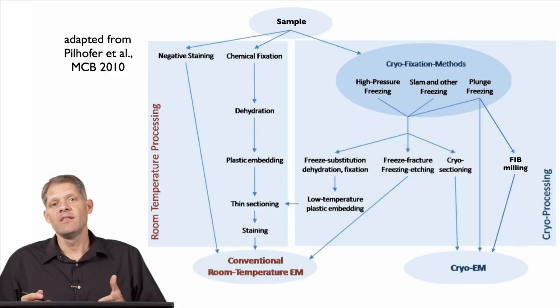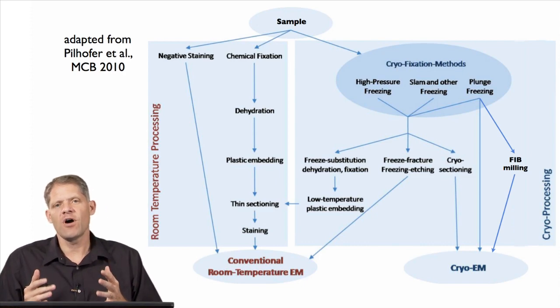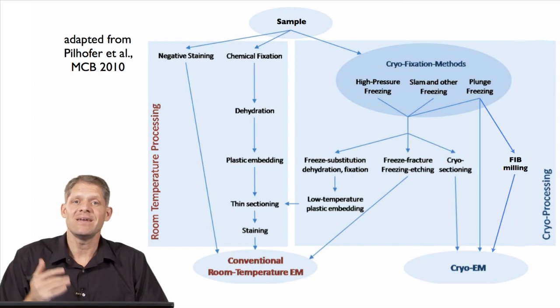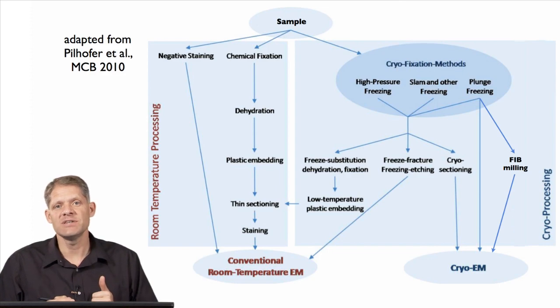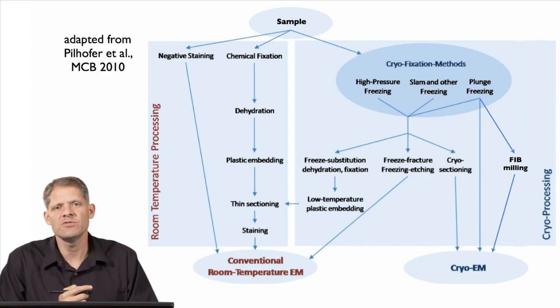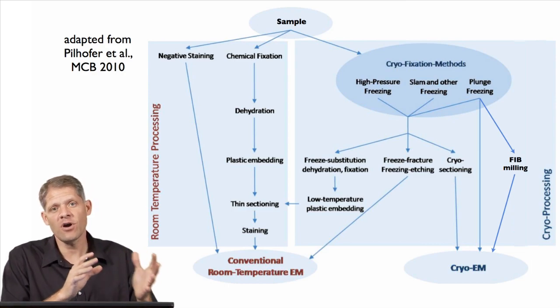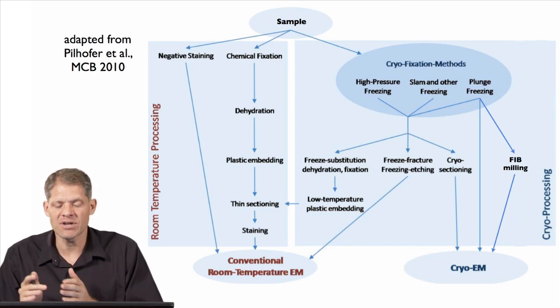So as you can see, there's a myriad of ways that biological material can be prepared for transmission electron microscopy. The key is always to stabilize the material so that it can be inserted into the ultra-high vacuum of the electron microscope. But in addition, if stains are used, they can enhance the contrast of the objects inside, and a higher dose can be used to image them. But some resolution is lost because then you're imaging stains that simply decorate or coat or form a replica of a structure rather than imaging the structure itself.